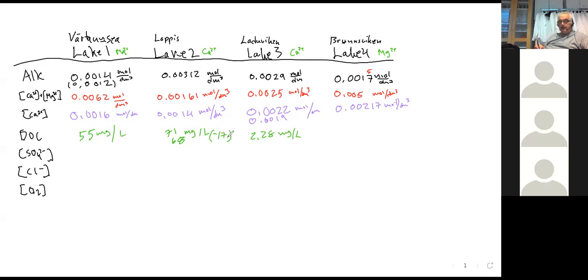But the blank indicates that there is a self-decomposition of the permanganate ion or some systematic error at least, but I think it is self-decomposition of the permanganate. But still, even if you remove the blank, it's quite a lot. Yeah. Anyone with Lake 4?